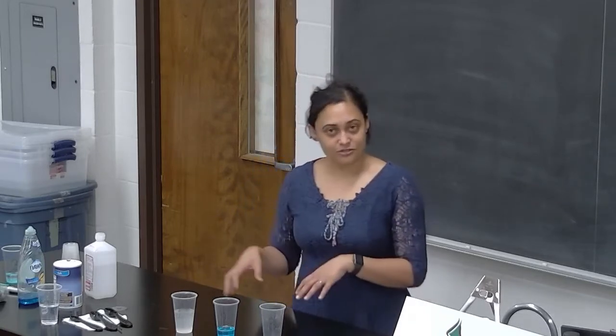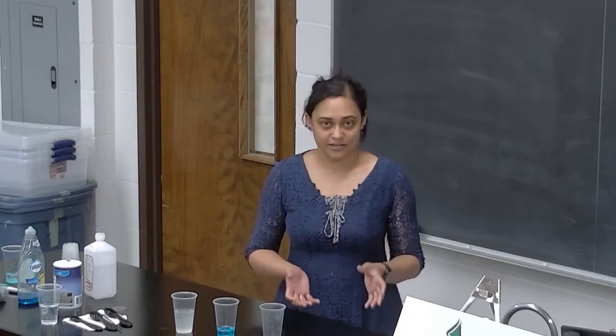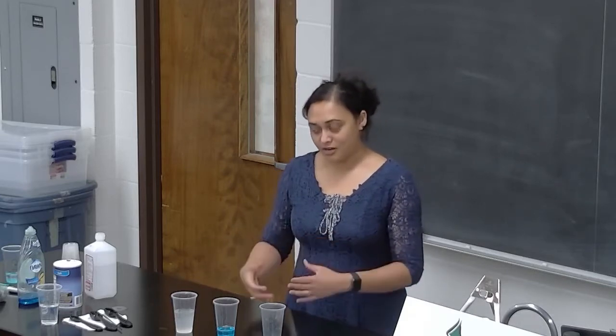So today I'm going to demonstrate how you extract your own DNA. When I say your own DNA, well, in a short span of time and with limited resources, we cannot expect to extract pure DNA. There might be other DNA inside our body, like microorganisms, many microorganisms like bacteria, whose DNA will also be extracted along with our DNA. We need many more resources to get pure DNA. But what we are going to extract today will definitely have our own DNA.